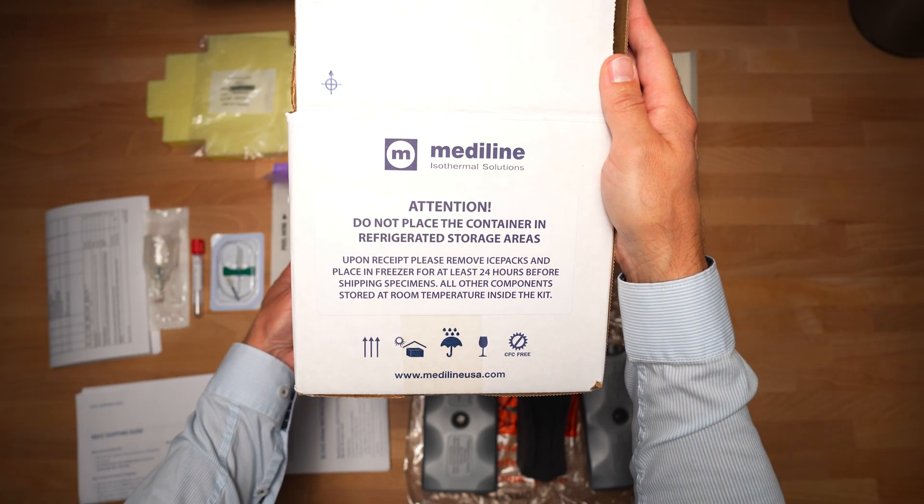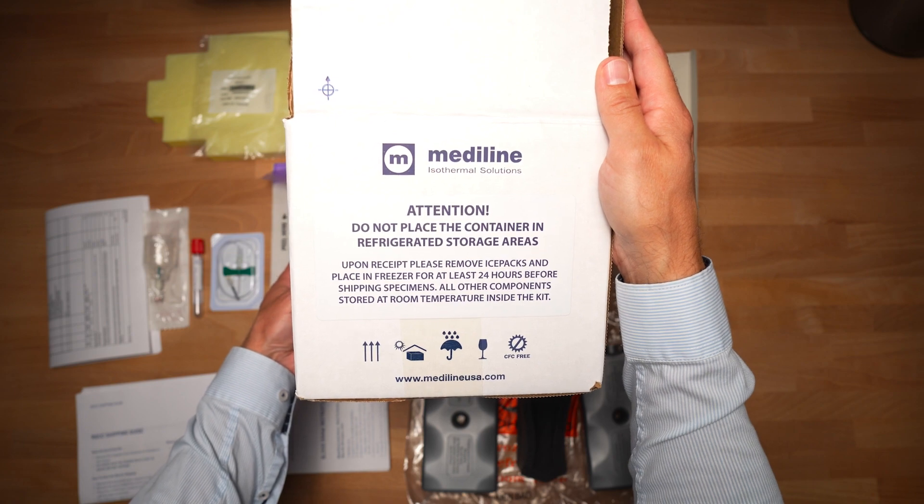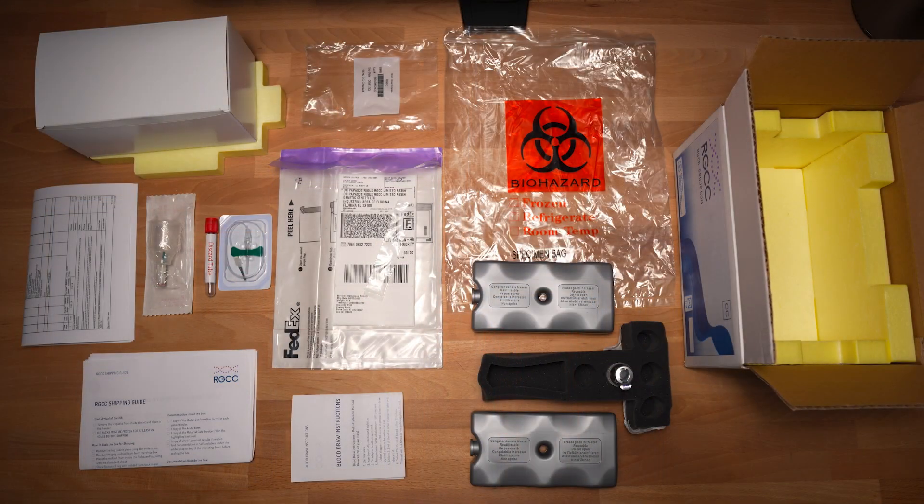Also remember, don't place the container in refrigerated storage areas. Upon receipt, please remove ice packs and place them in the freezer for at least 24 hours before shipping specimens. All other components should be stored at room temperature inside the kit.